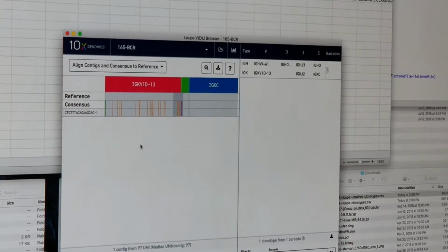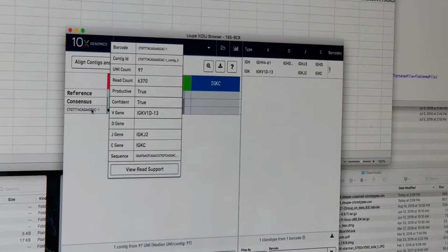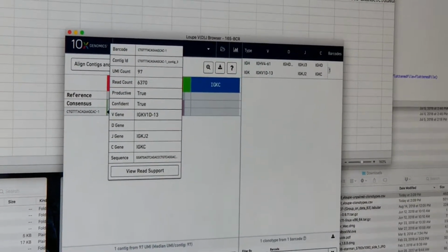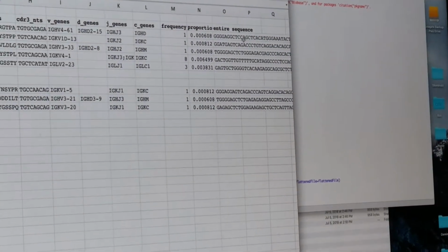But the way I would look at this is I would open this up to show that, and maybe copy this sequence, which I have right out here on the end, and then you can come in and look for the ATG and then just split it out by threes and see if you find a stop anywhere along the way.